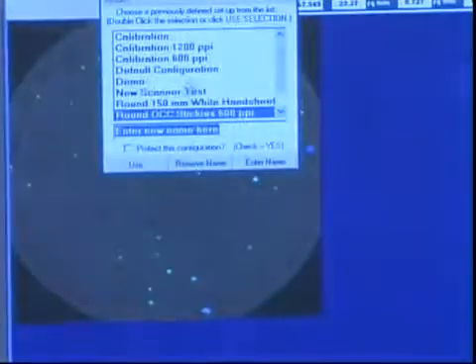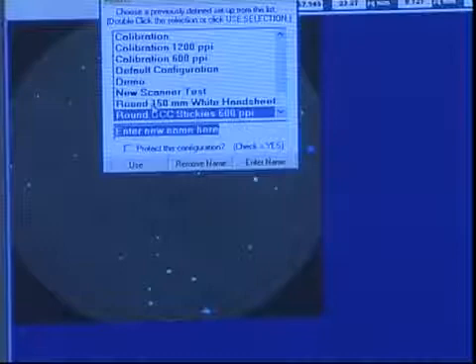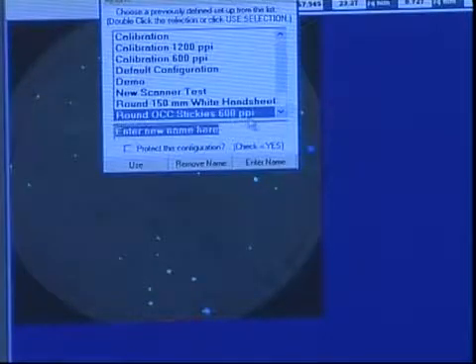I will turn off the setup mode altogether. And as you can see, in the lineup of tests that are available, this is the round OCC stickies. This is the white one we ran previously. And we have selected the right one to run automatically.